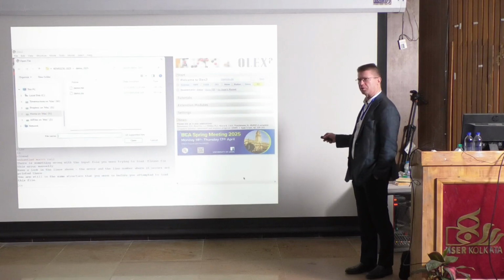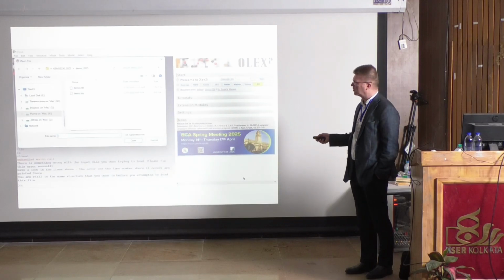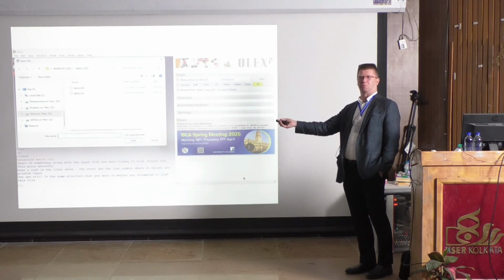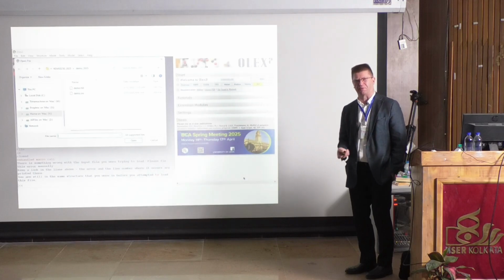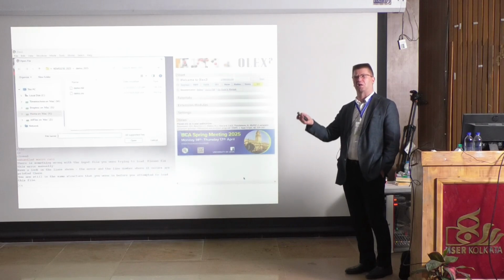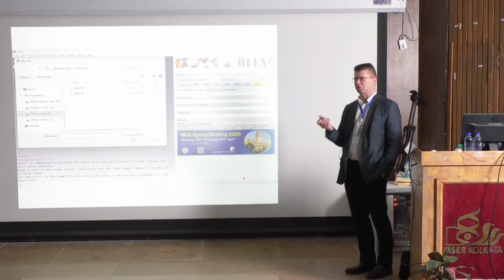And there are 2 files. These 2 files come from the instrument. You can see there is an ins file. It's very easy to understand, it's the instruction file. This instruction file has a certain format which the program on the diffractometer has already written. So it's ready to go. It's our input file. It doesn't contain any information about the structure. It contains information about the unit cell and all the other things that the instrument can find. But it doesn't know, of course, the structure.